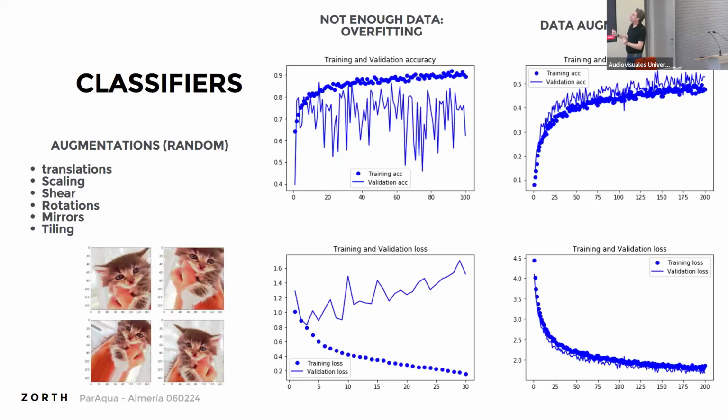So why is that? Well, I just told you, you split your data set into training and validation, and then you're following through the epochs while you're training. You're following whether the training accuracy and the validation accuracy are starting to match. Ideally, they will get close together, and that means that your model is learning. Okay. If they depart from each other, like this or that, that means that the model is not learning. In that case, it is overfitting.